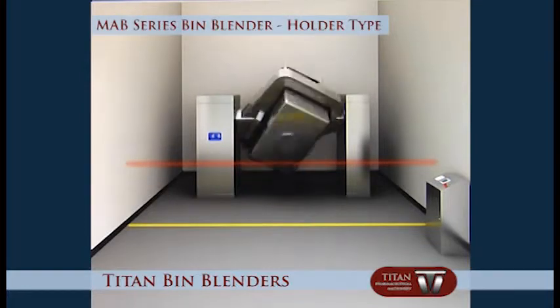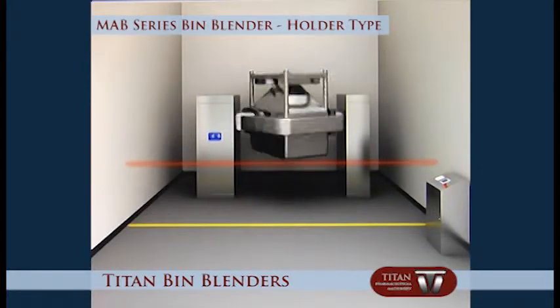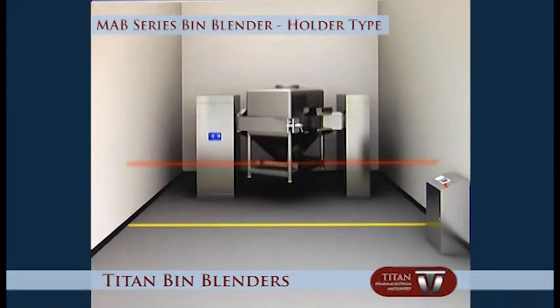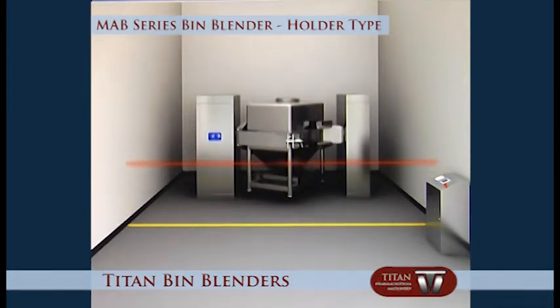When mixing is complete, the bin blender will automatically stop and orient the bin to a vertical position. The bin is then lowered automatically and the data for this batch is printed.